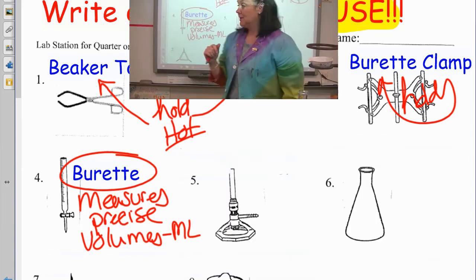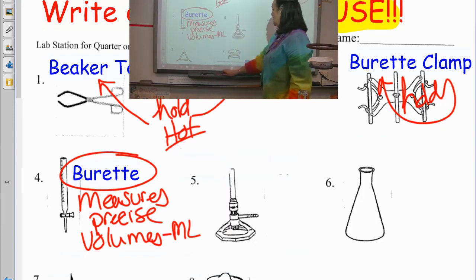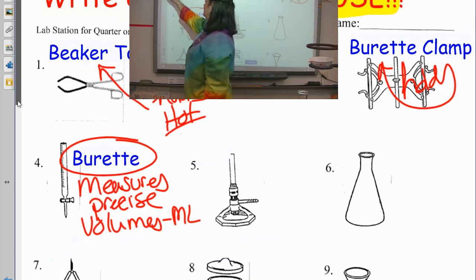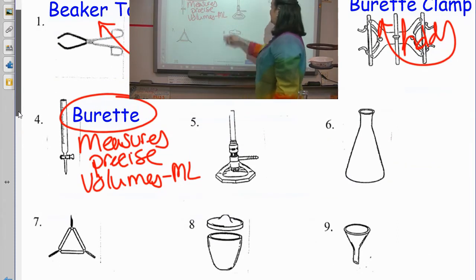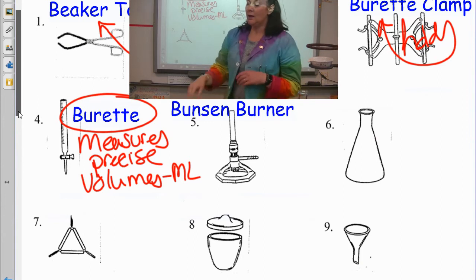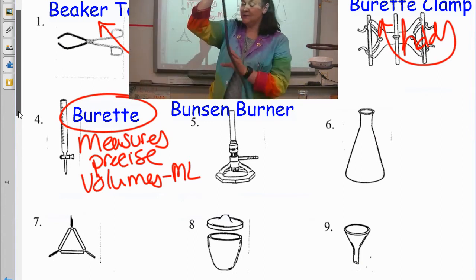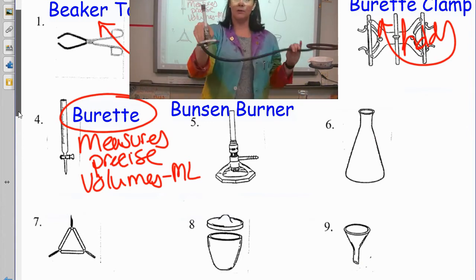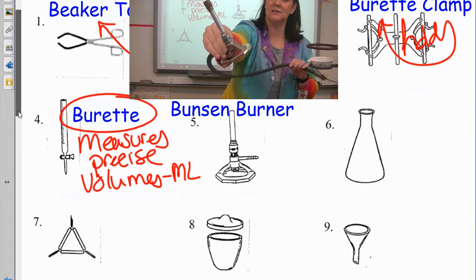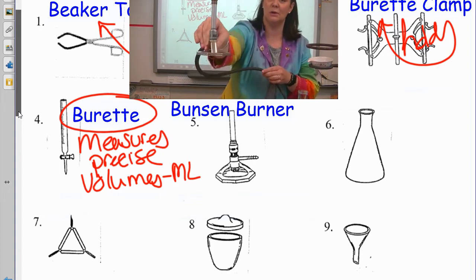What do we have next? Everybody's favorite for the next one. Hopefully you got this one right if you were guessing them. This one is called a Bunsen burner. And the Bunsen burner, we're going to learn how to light these next week. The Bunsen burner, hopefully it's a little classic look for when you think of chemistry, you might think of Bunsen burner.